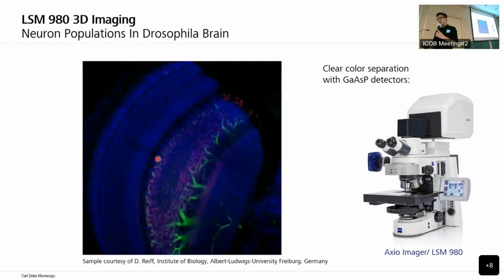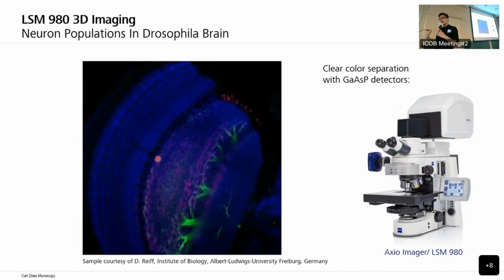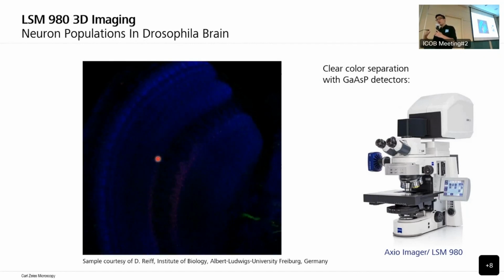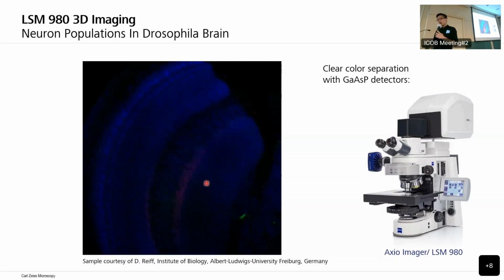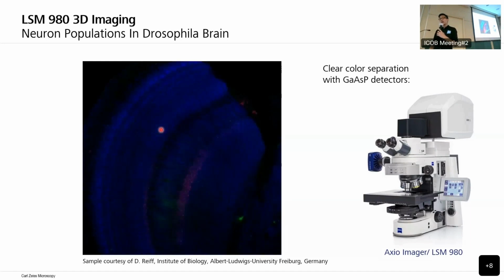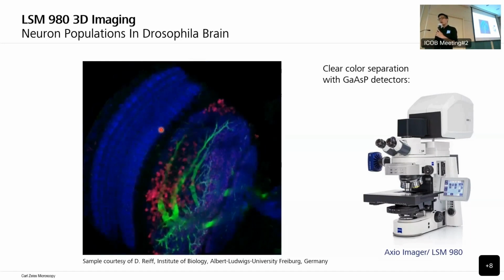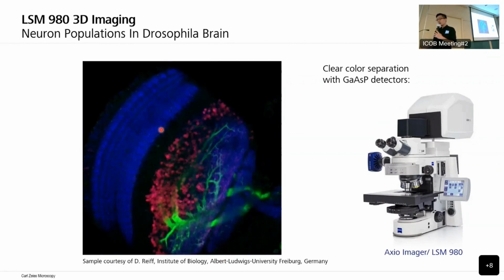But by using the confocal, we can simply use the laser light to go through the cuticle layers, and then we extract the in focus structures here and do the Z-stack images to reconstruct the region of interest we want.